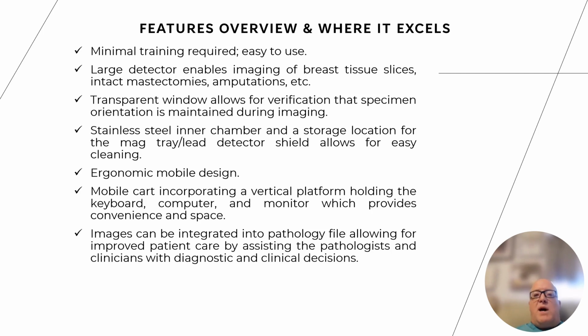It's got a monitor, mouse and keyboard apparatus that you can move up and down depending on the height of the preceptor, whoever's utilizing the system. The images are easily uploaded into a network folder or the LIS. You can also put them in PACS. There's a lot of variety in what you can do with the images, so that's nice.